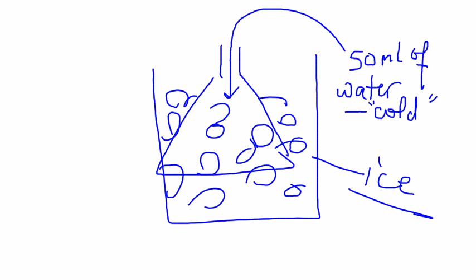So while one of you took the time to set up your hot bath to form aspirin, you should also take another flask or a test tube with about 50 milliliters of water, which you should just put in ice to have it as cold as possible. By the time you need it, it will be nice and ready.